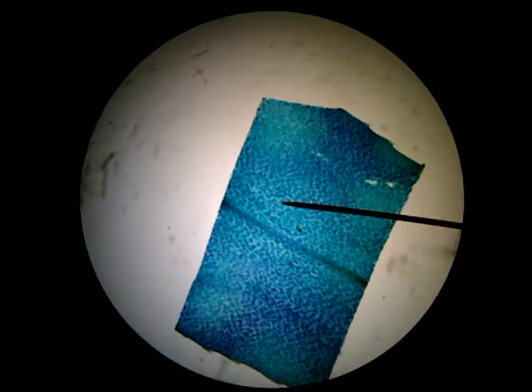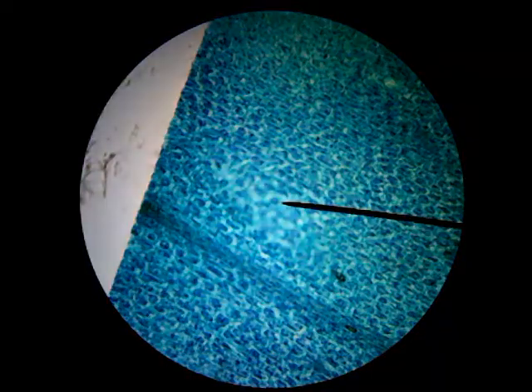That's my red objective — the least amount of magnification I can do on this microscope. I'm going to switch now to yellow, and we should start to see a few more details.